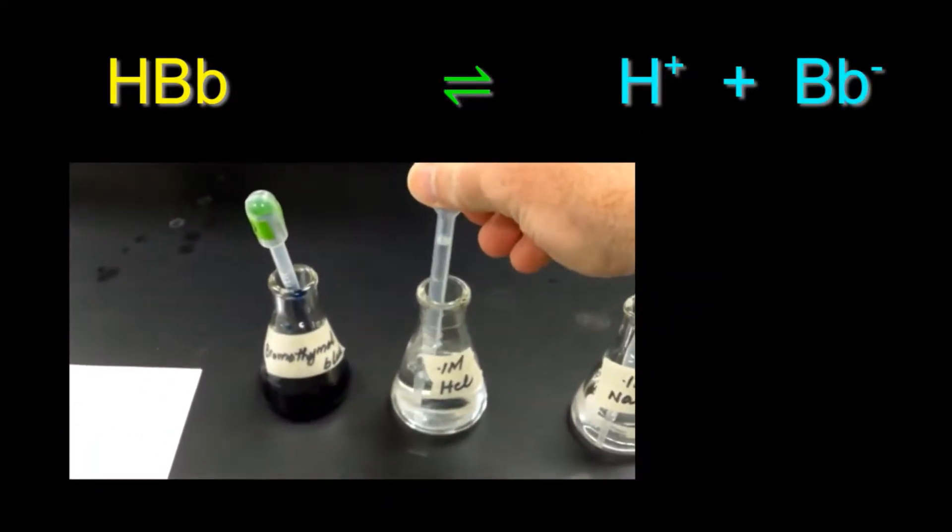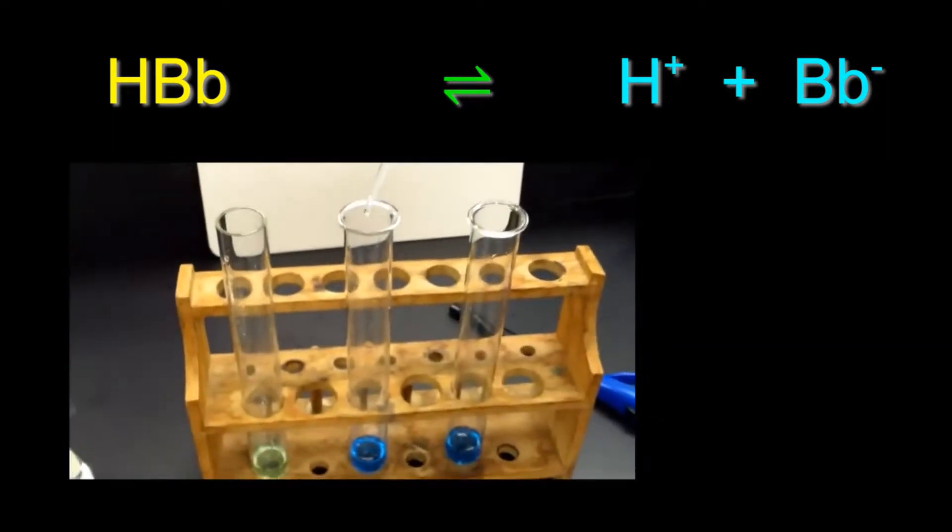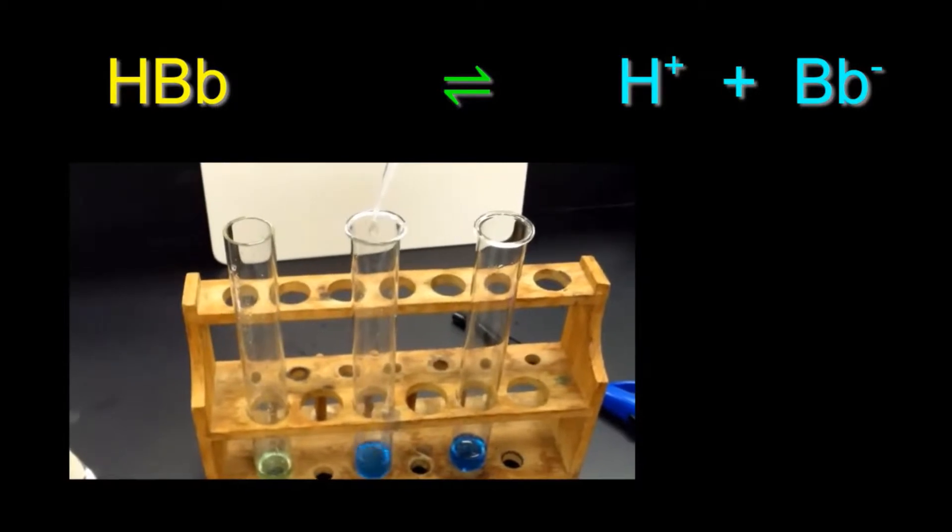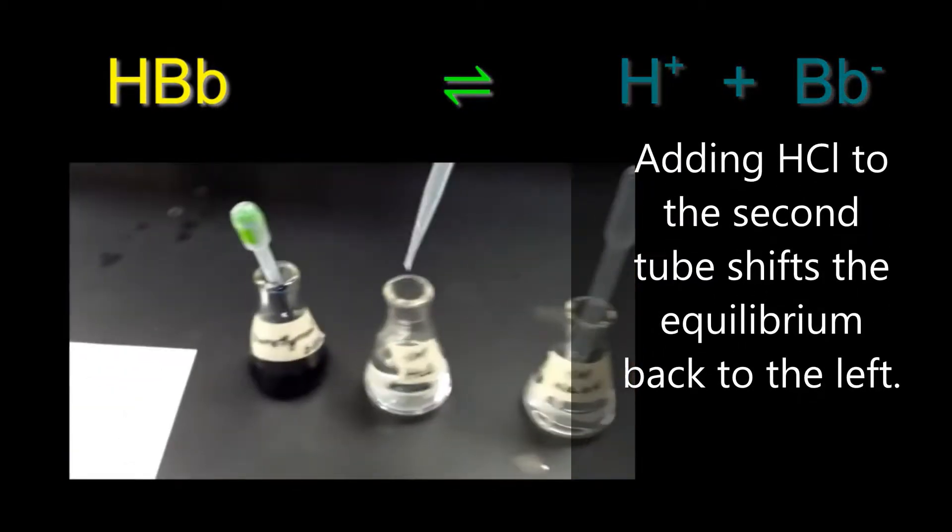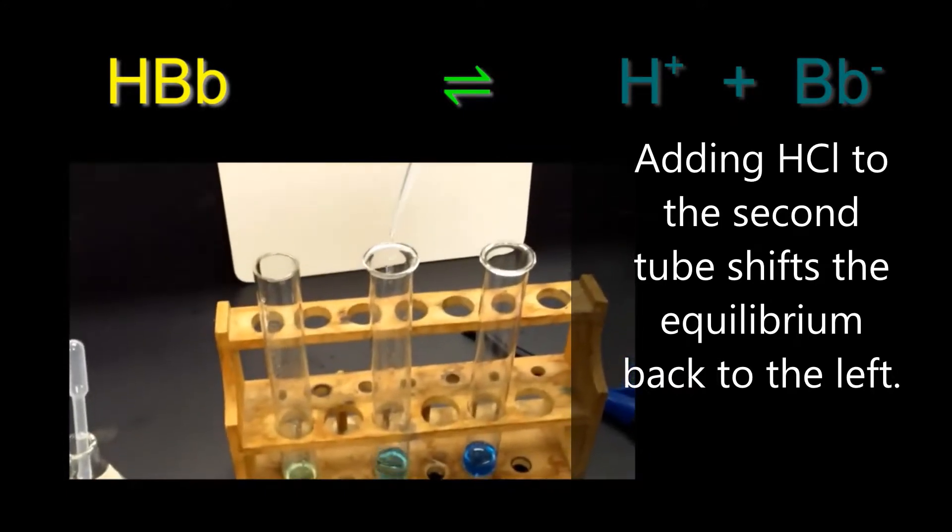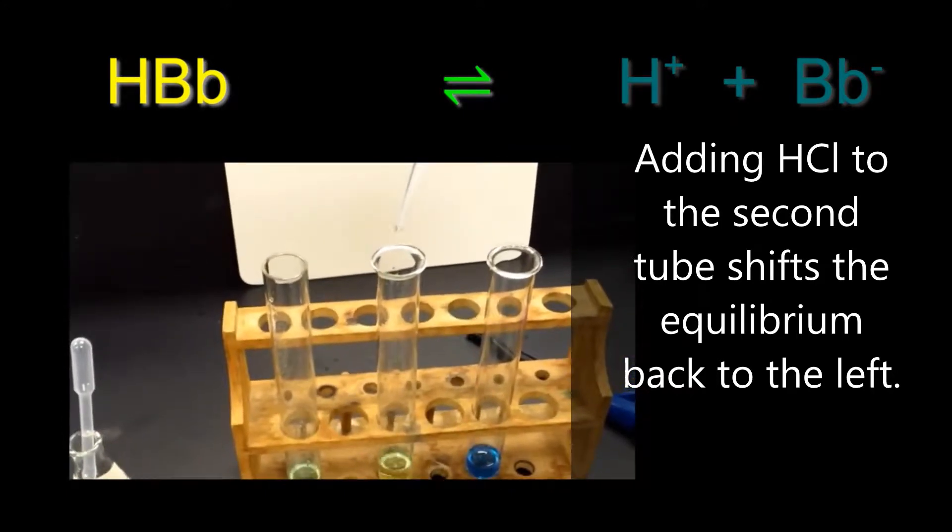If we add hydrochloric acid back into the second test tube, if we add enough, so we'll need to add a little bit here, plus a little bit more, we should see that the color will turn back to yellow because the equilibrium position is being shifted back.